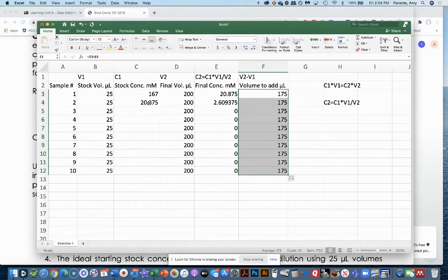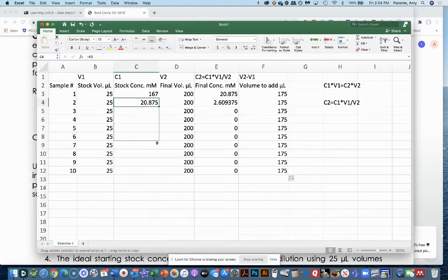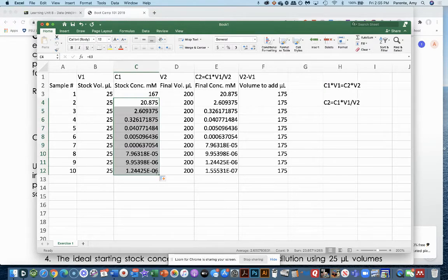Now the last thing I need to do, and you'll see this all come together once I pull this down: it's going to put this concentration in here and then fill the table in. Then it's going to put the next concentration in here. So watch what happens when I pull this down. Essentially this is saying I want to copy and paste and fill the table with this equation. So I'm going to pull this down, and it fills everything in there, okay?